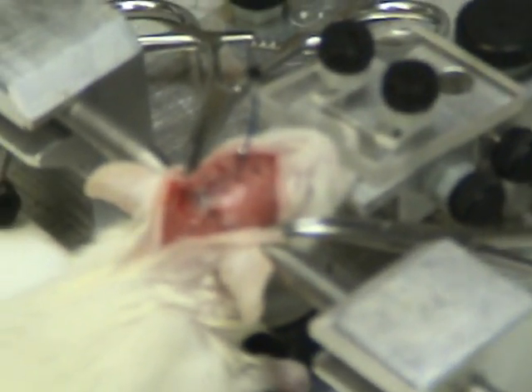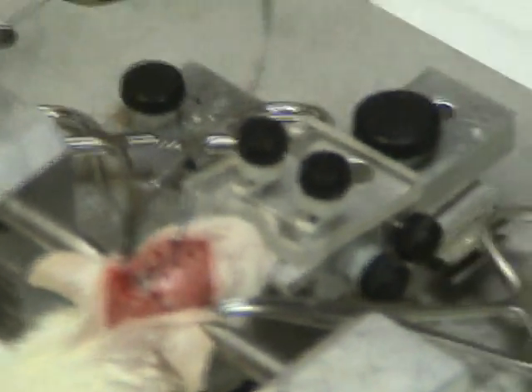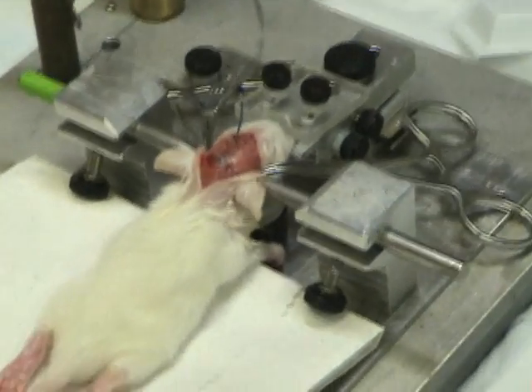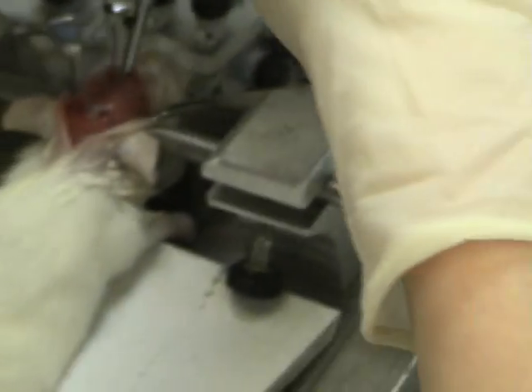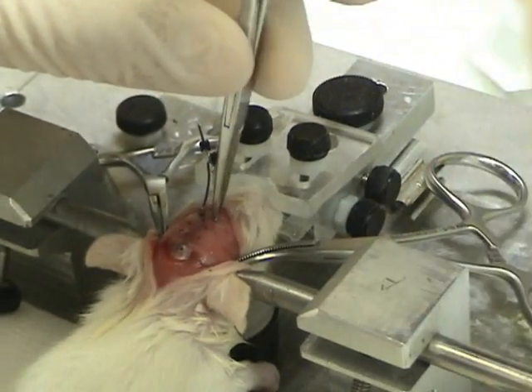In the case of the old animal, the skull is a little bit more firm. The skull of this young rat is so soft. I always try to put the electrode without blood, but it's impossible, I think.